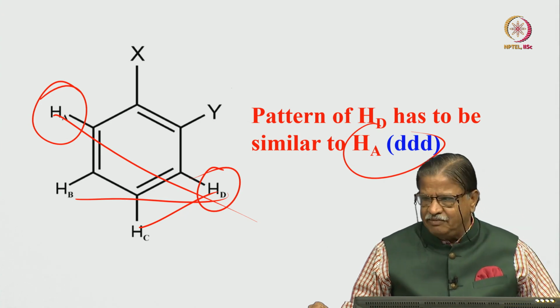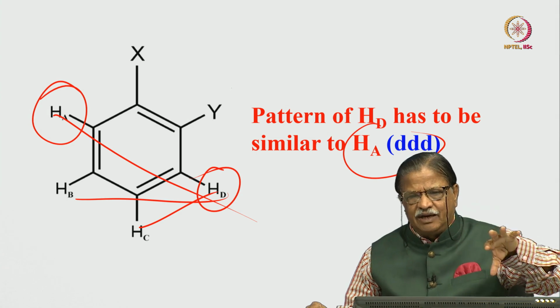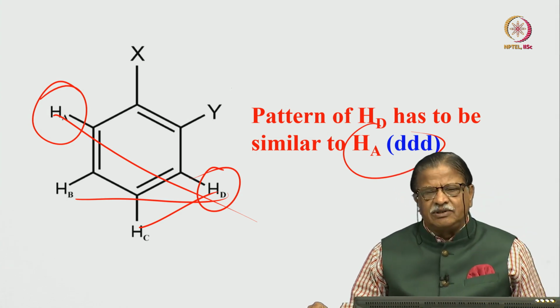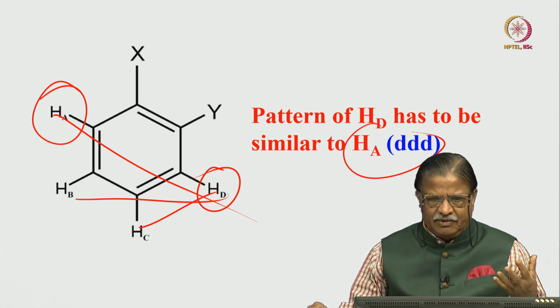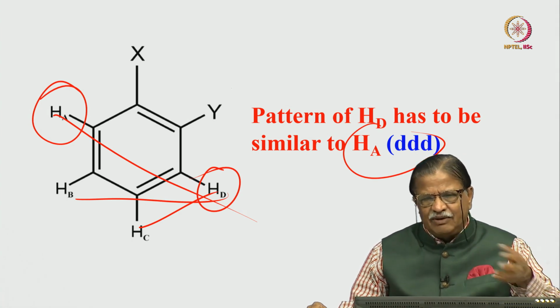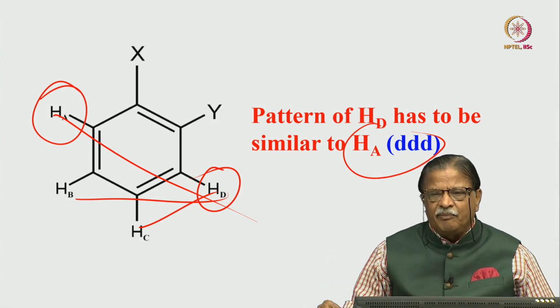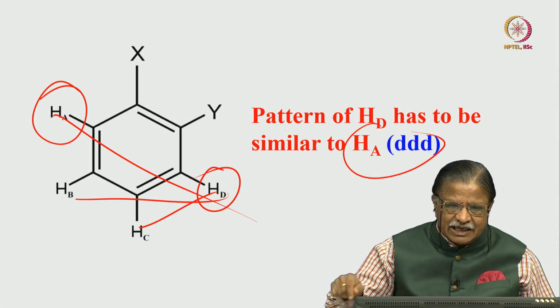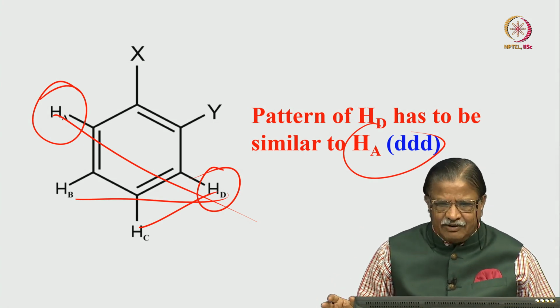Further, we went to the phenyl groups. We also saw how the pattern looks for a mono substituted phenyl group, and if it is asymmetrically ortho substituted, how we get it. We understood the spectrum. So, we can go further and see what will happen for different substituents from the next class, and then we analyze more complex spectra with heteronuclear couplings, satellite spectra, and varieties of things; subspectral analysis we can do. We will continue that further.